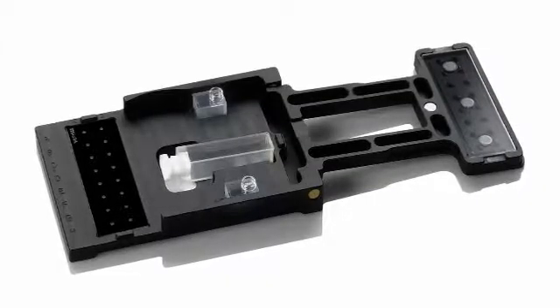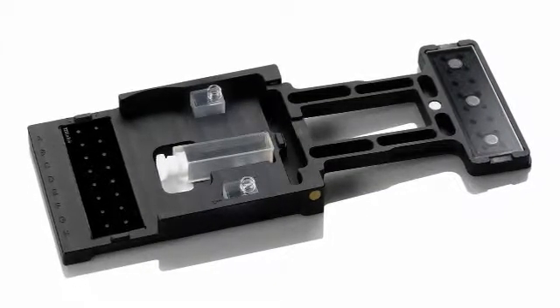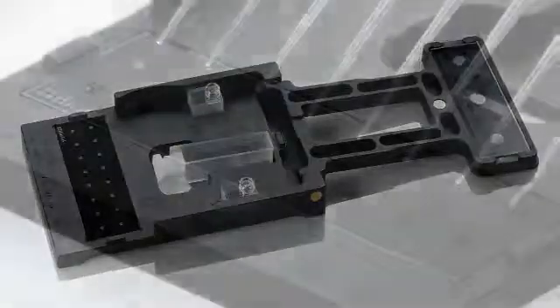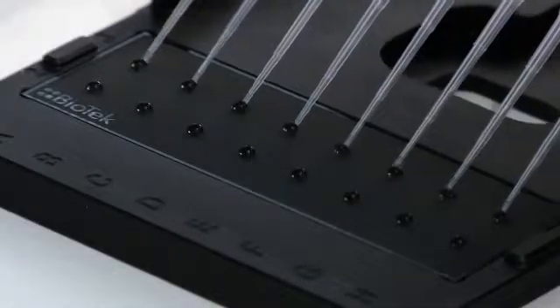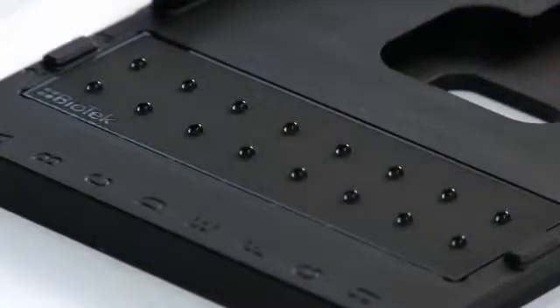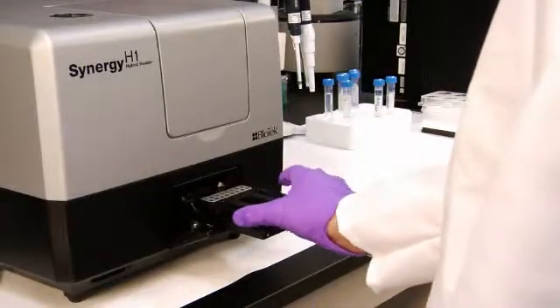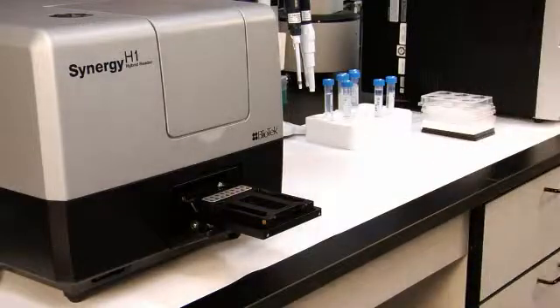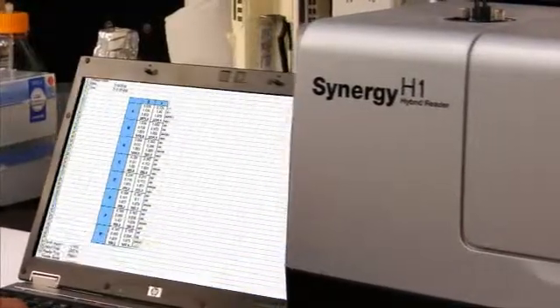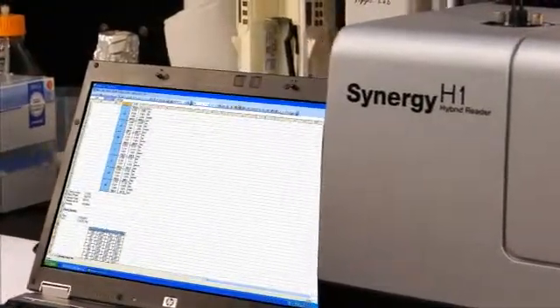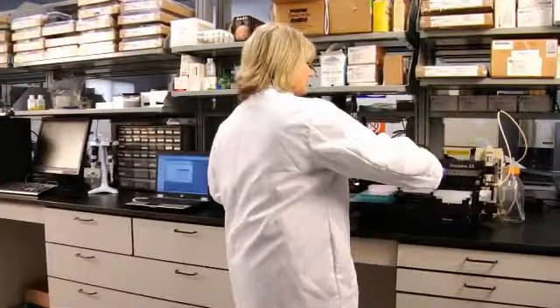In addition, Synergy H1 is compatible with BioTek's unique Take3 plate. The Take3 plate has a simple but innovative design for measuring multiple 2 microliter samples, which is particularly useful for direct nucleic acid and protein quantification. Using the Gen5 software, the results are calculated automatically and displayed in an Excel sheet.